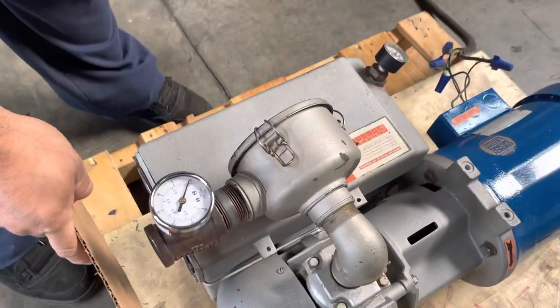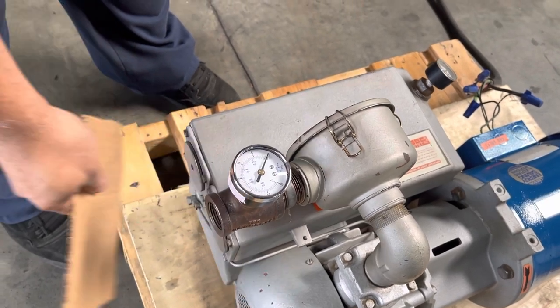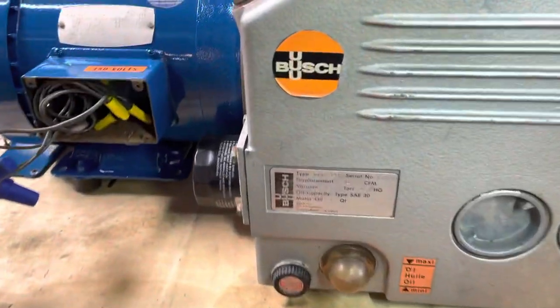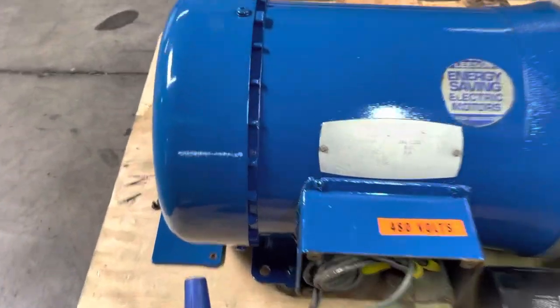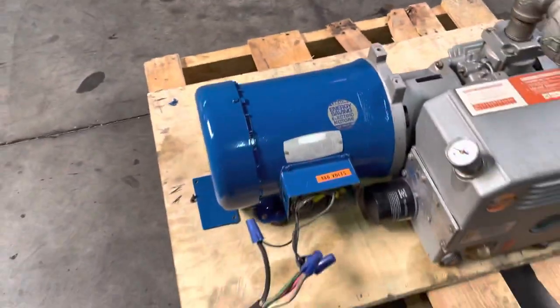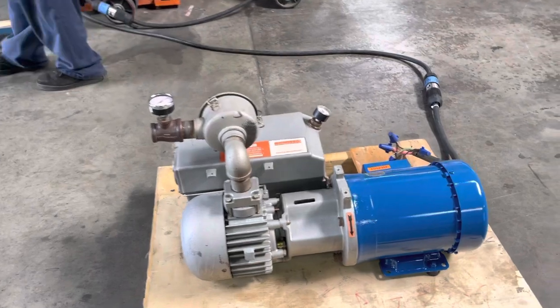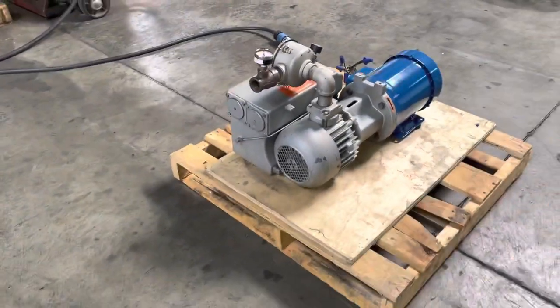See the gauge right here? It goes up to about 27, 28 inches. I'm going to turn it on — okay, it's on. That is a Busch three horsepower rotary vane vacuum pump.